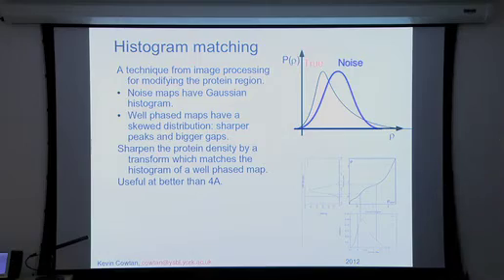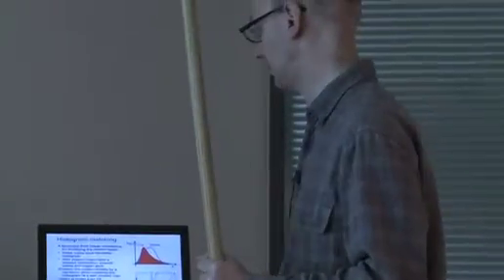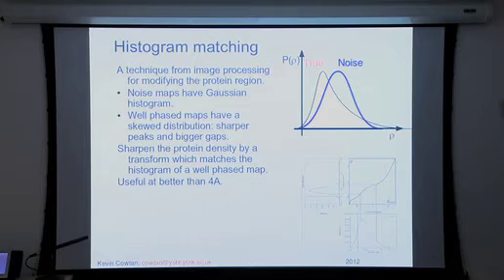That's how it works. You can find similar features in your photo processing software. This works well. It's effective at better than 4 angstroms resolution. So those are very simple: something we can do to the solvent, something we can do to the protein, and they're complementary, and we end up with the whole map being improved on aggregate.